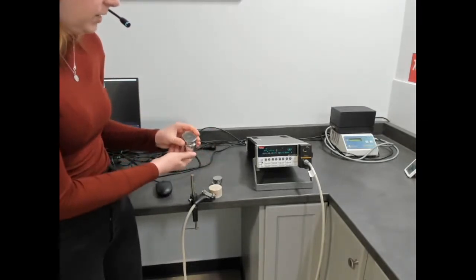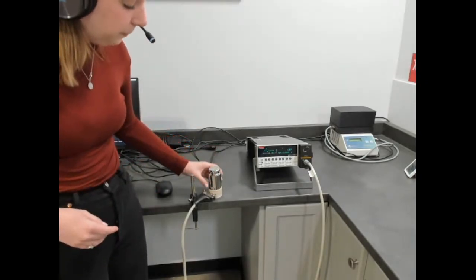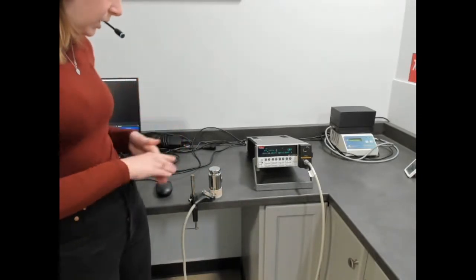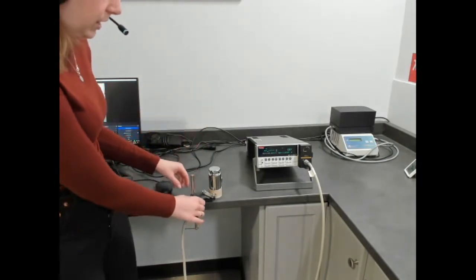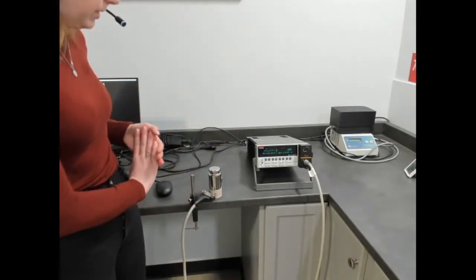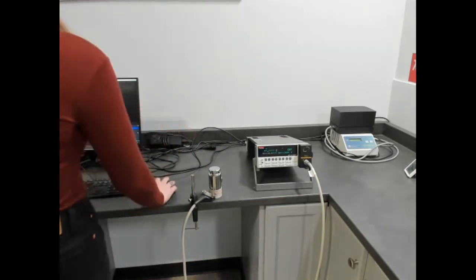The TPS-3 also comes with a 1 kilogram weight that's placed on top of the sample setup. This is just to ensure a good contact between the two samples and the sensor. So that's pretty much all there is for setting up a sample with the TPS-3. This can be clamped to any table and adjusted to accommodate for different sample sizes. So we're just going to move over to the software and set up a measurement.